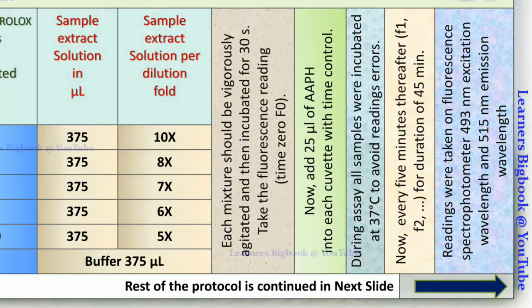Like this you repeat this part of the experiment till 35 or 40 or 45 minutes, with 5 minutes of interval or time control.